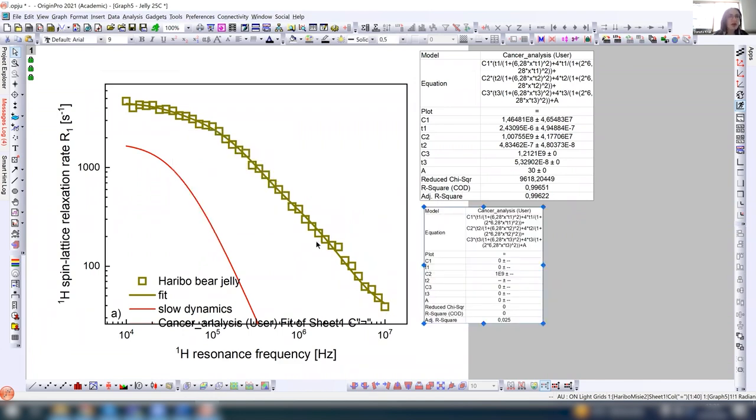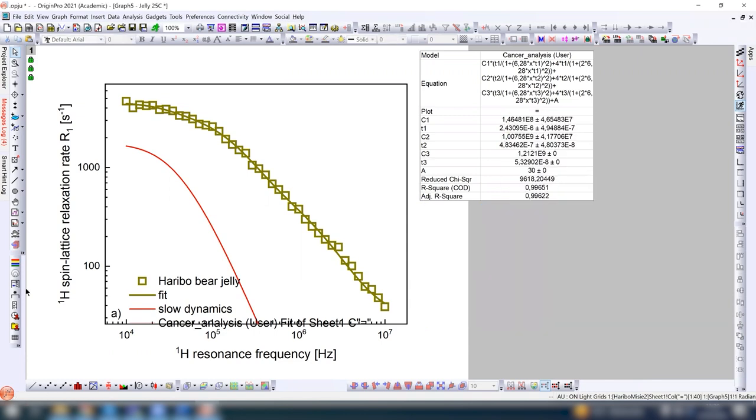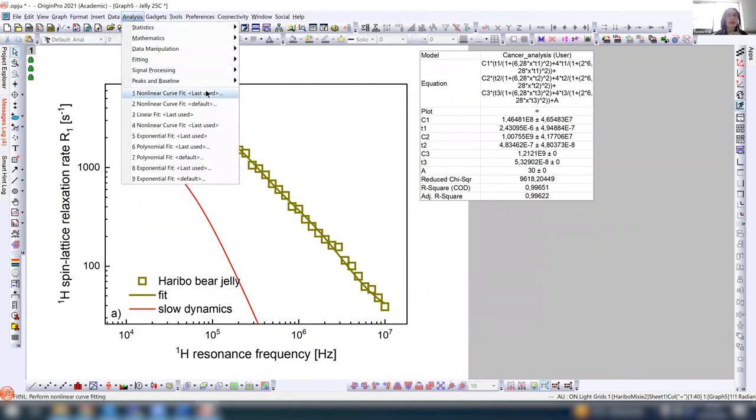Well, I don't know actually what happened. For some reasons, they understood nothing. Hocam, we couldn't add the T2 value. Yes, I know. I have to do it again, sorry. Yeah, but maybe it's not so bad. Last used.